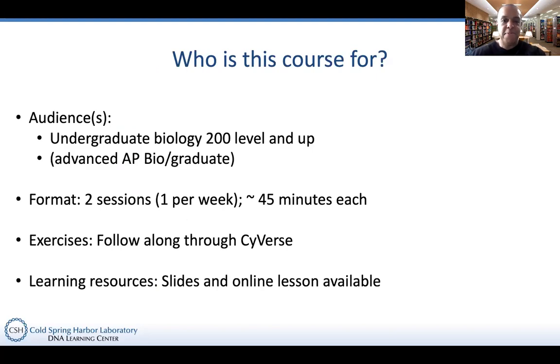We're going to aim for 45 minutes in part two here, just like part one. This is only a two-parter. The other thing is that these are going to have some exercises which you can also follow along. So you're going to need a Cyverse account. I'll mention that later, but it's all free. And we're going to post these slides, and there's an online lesson to follow along in detail.